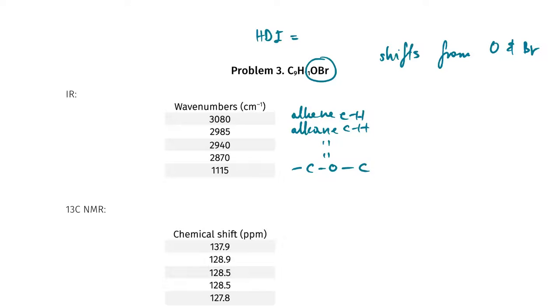And that's pretty much it. What we don't see is no carbonyl, no CC triple bond, no C triple bond N. Oh, bless you. We don't have nitrogen in the molecule, so that's an automatic no-no.